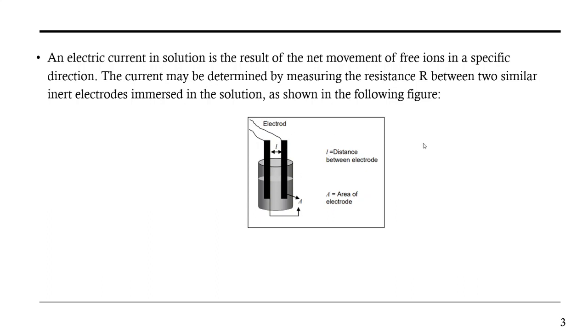In the video, Dr. Faisal highlighted that the electrode has to be carefully used because it's a very sensitive and expensive probe. When you measure the conductivity of the solutions, make sure that you don't use it as a stirrer, because you might break the sensor.